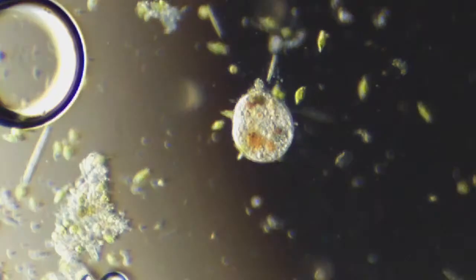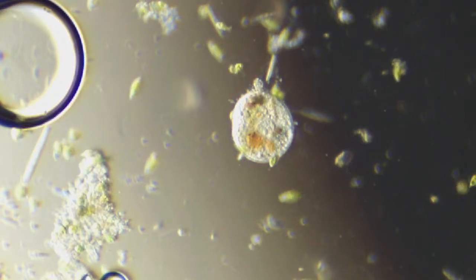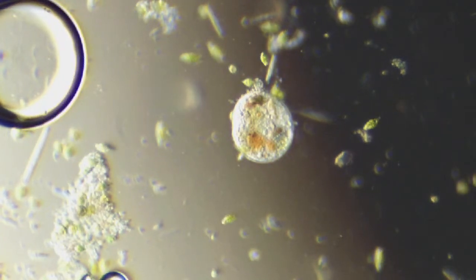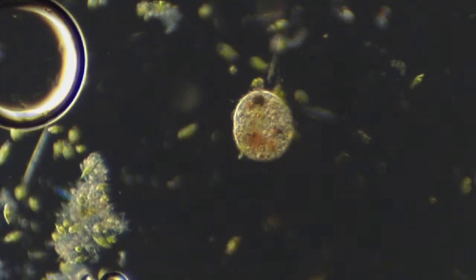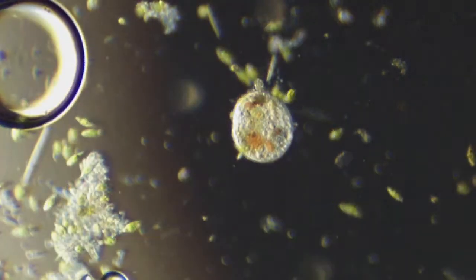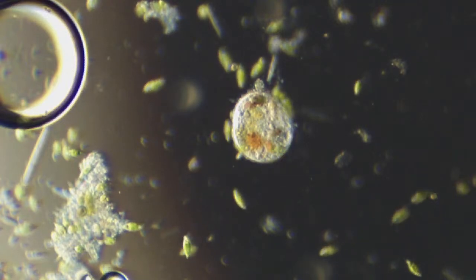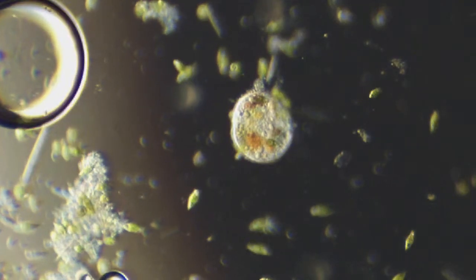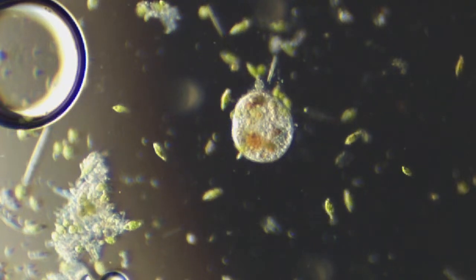See if I can get a little more oblique lighting on it to make it pop. Let's go full on dark field. Dark field looks great. Hope Henrik gets a chance to watch this. His music really fits the mood.